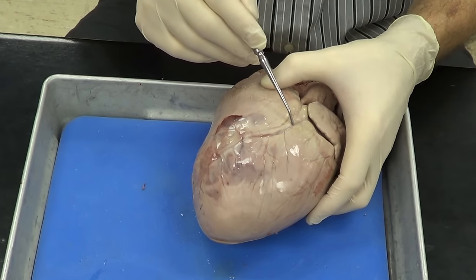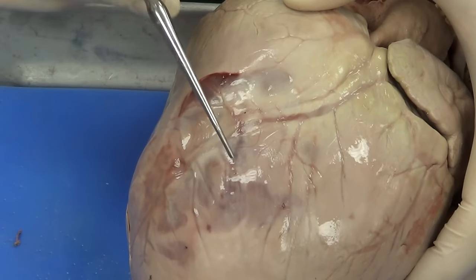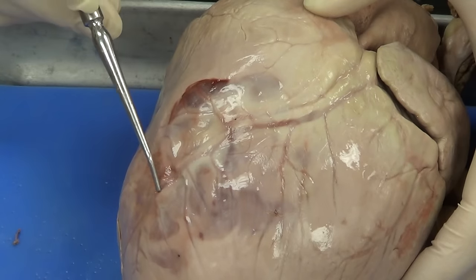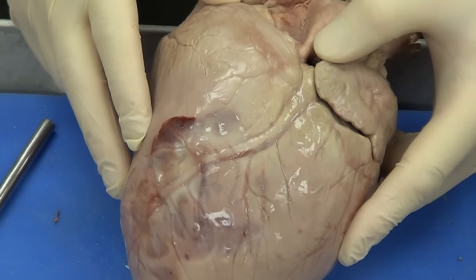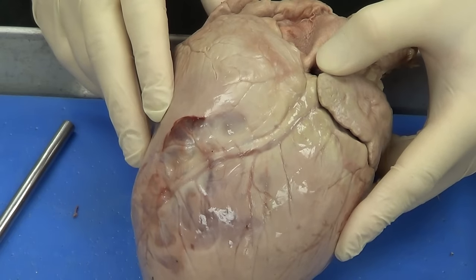You can see this blood vessel right here going down around the heart, giving off many branches. This is going to be the coronary artery. This is the main artery that's going to feed the heart. In fact, this is one of the first arteries that actually come off the aorta, which is the main blood vessel coming off the heart.